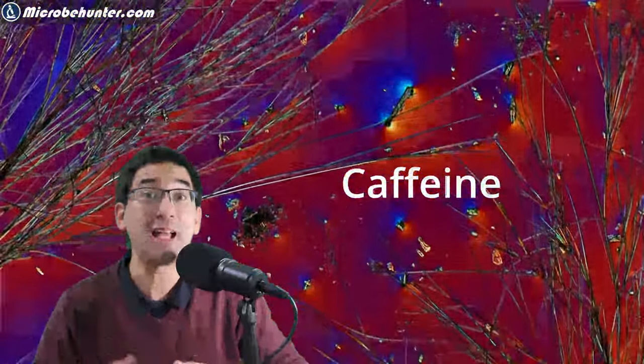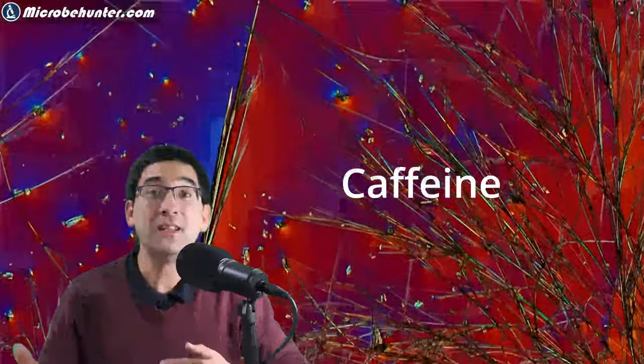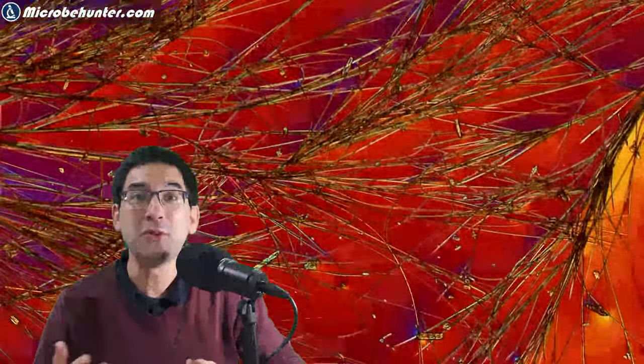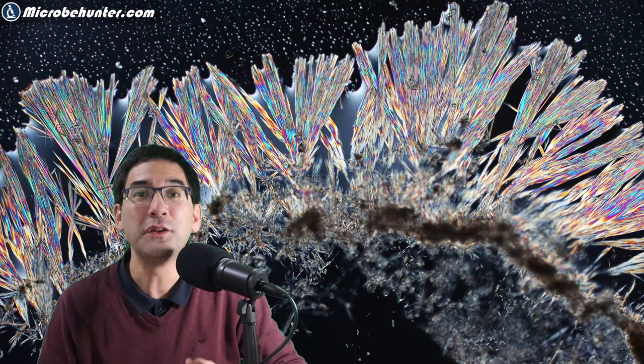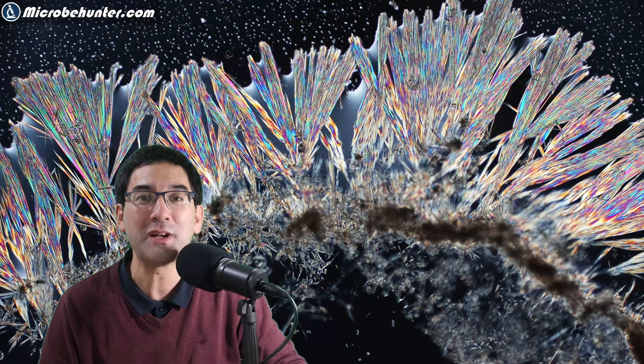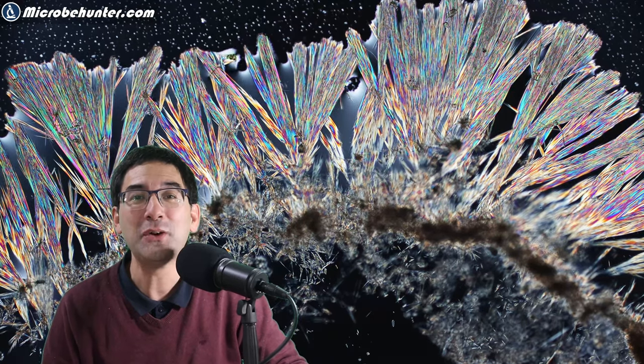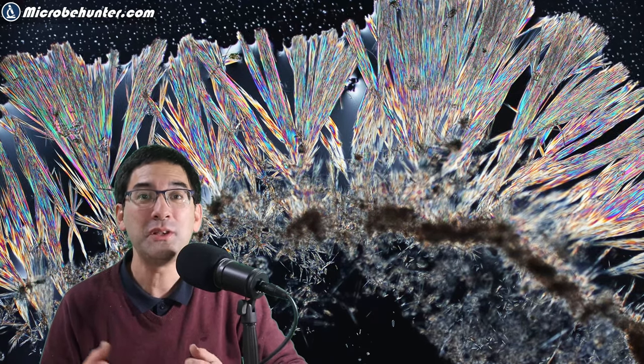That is the stimulant drug that can be found in coffee, in tea, in chocolate, and also in certain energy drinks which are sometimes enriched with caffeine. What you see right now in the background are crystals of caffeine that I observed under the microscope using polarized light.